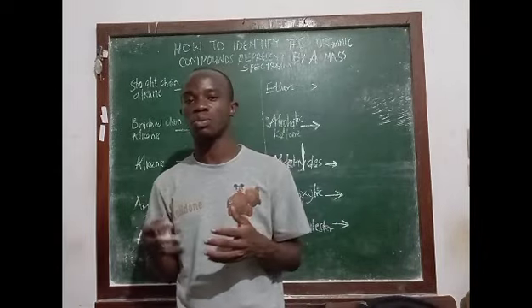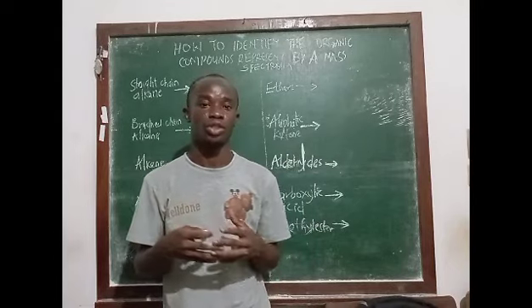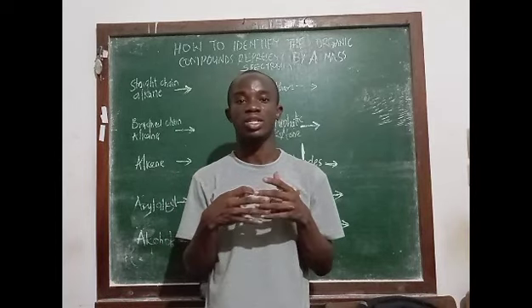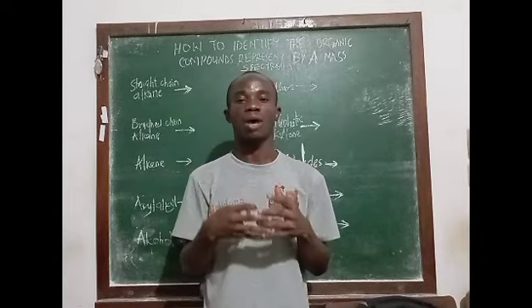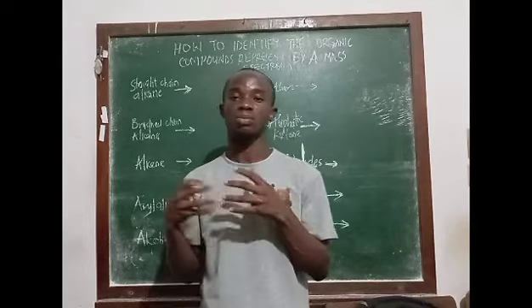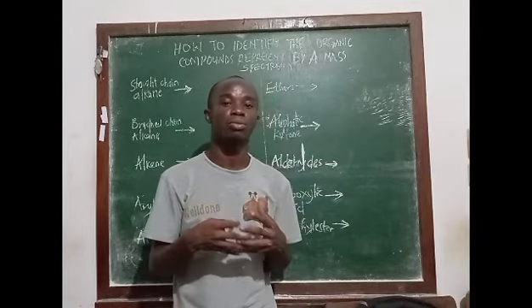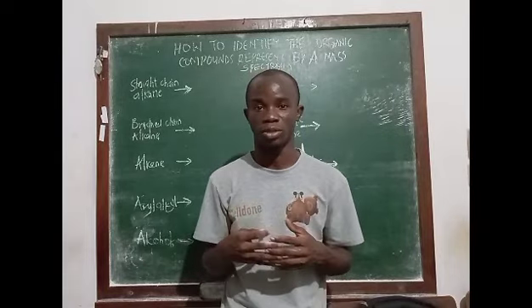At different mass to charge ratios, you always see a signal that represents a particular ion that was formed during the ionization process in the mass spectrometer. The signal also represents the abundance of this ion, which most times depends on the stability of the ion that is formed.